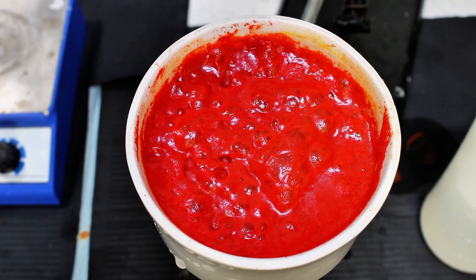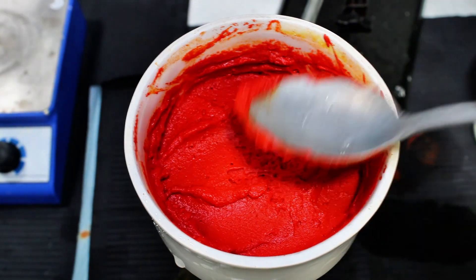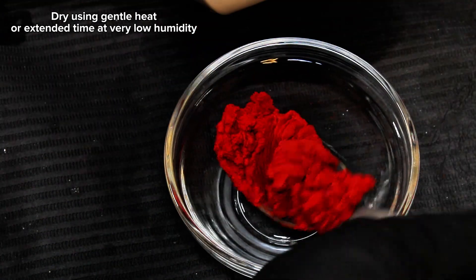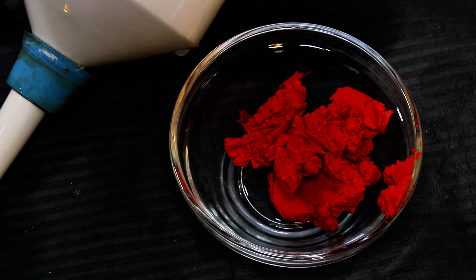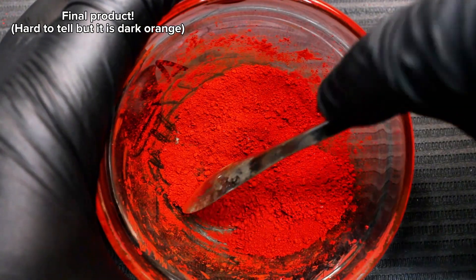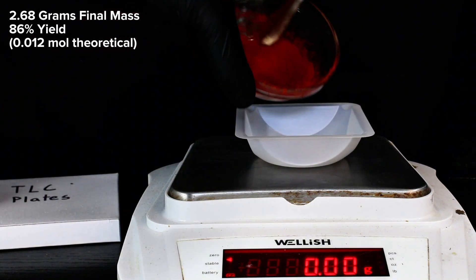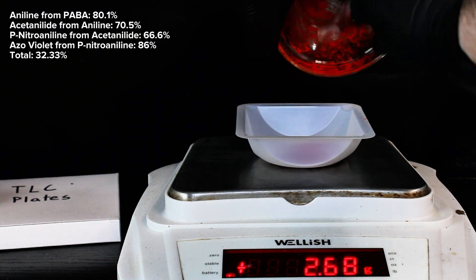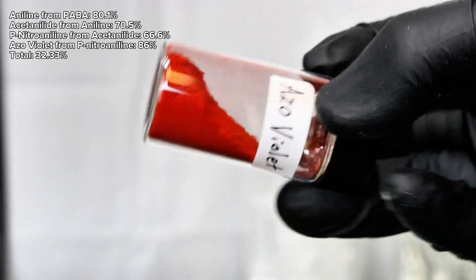As soon as all the water had eventually been pulled off, the product was thoroughly rinsed with more ice-cold water, transferred to a drying dish, and then allowed to dry on my desk for several days. This stuff holds onto a ton of water, so drying it this way is going to take a really long time. There are obviously quicker methods if you're impatient, but I had other things to work on. After several days had passed, the Azo Violet had dried completely, so I crushed it into a powder and weighed it for a final mass of 2.68 grams, representing an 86% yield. If you instead look at this in the scope of the entire synthesis procedure going back to PABA, my true percent yield is 32.33%, which I consider pretty good for a 4-part organic synthesis.